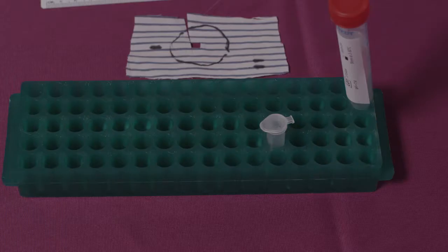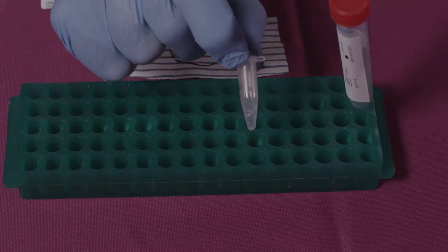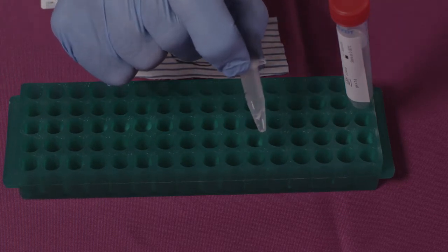Since the buffer is PBS, the remaining extract, 180 microliters, may be retained for DNA analysis.